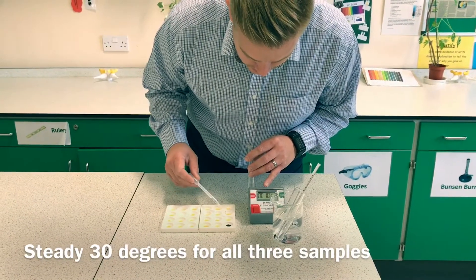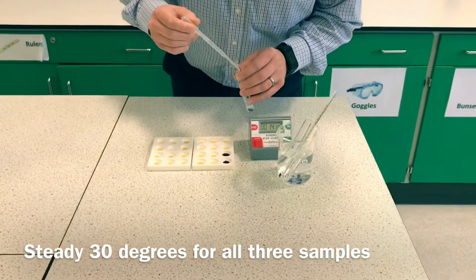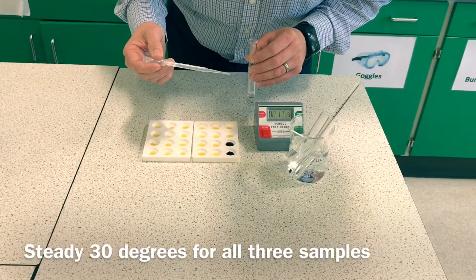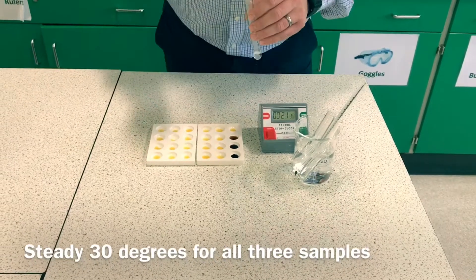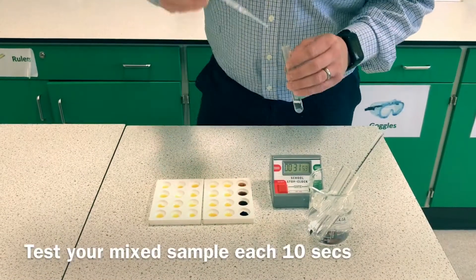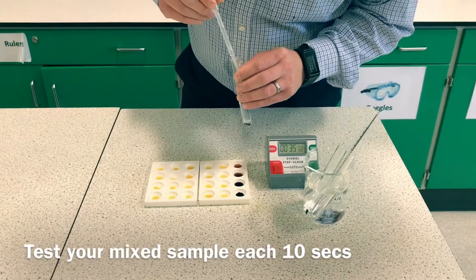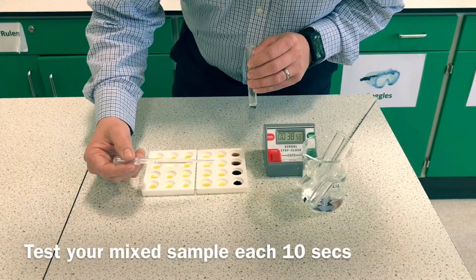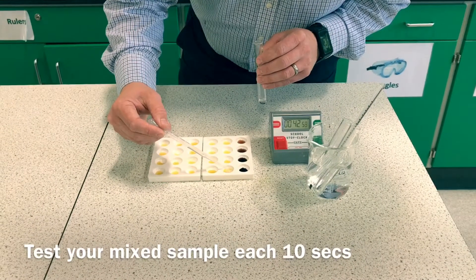Every 10 seconds I'm going to test the starch again. As we can see, the amylase is digesting the starch — every 10 seconds it's getting clearer and clearer on our iodine indicator.